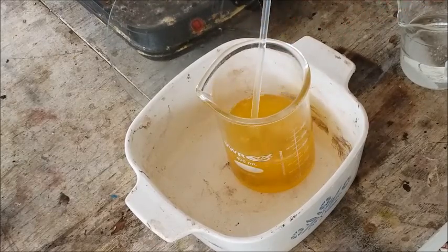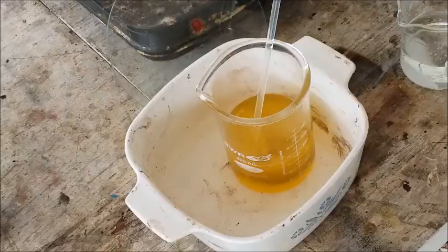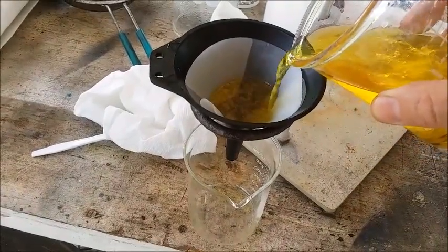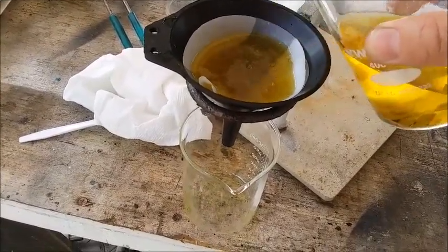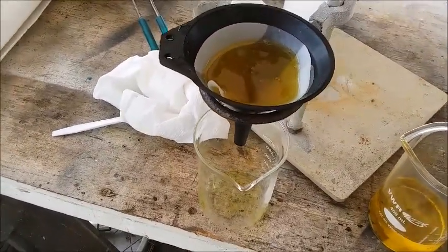Next thing I need to do is filter this stuff. Then we can drop the gold with SMB and see what we got. Okay, here we go, filtration. I'm not going to bother getting the vacuum filtration rig out for such a small amount of liquid here. I'll just use the gravity filtration. It'll take a while.